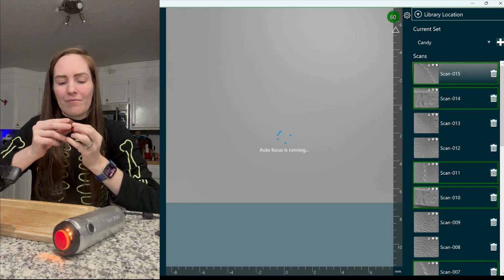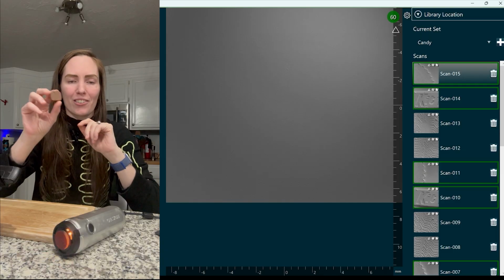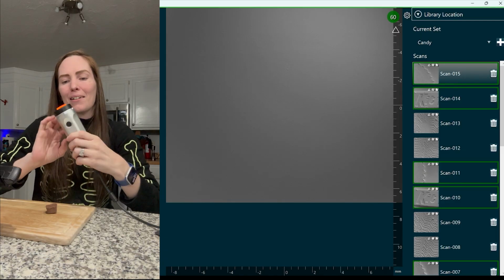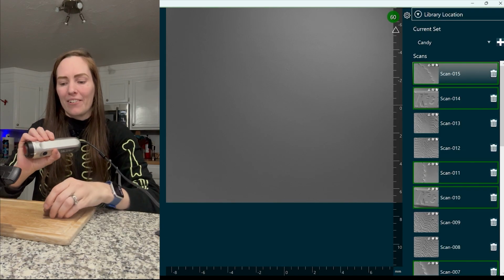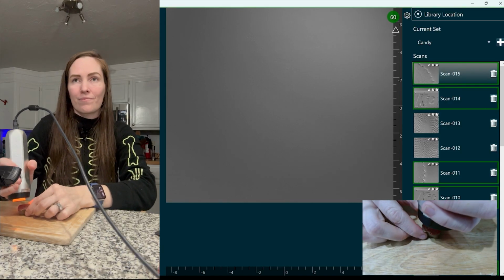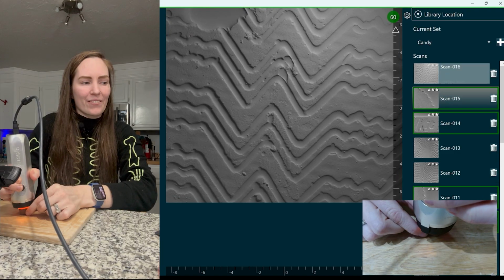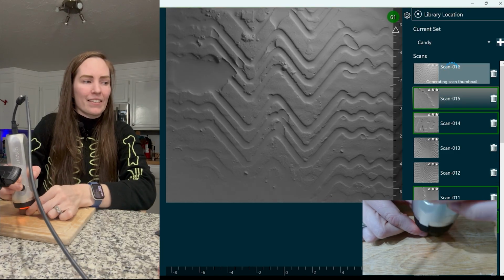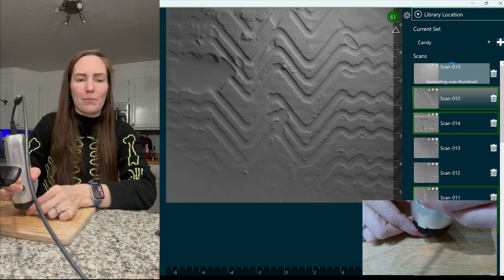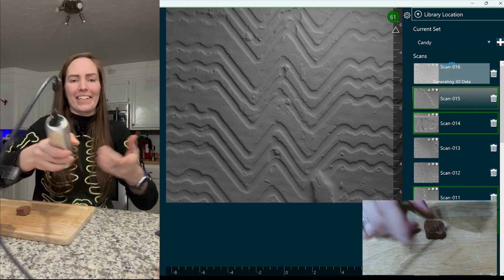So these must be resting on a textured plate or something like that to dry the chocolate with this pattern on it. And I'll press our system down onto that, press the gel into that, like this. And we can see all of that texture. We can also see some porosity there where I'm missing a little bit of chocolate. It's kind of a fun one. And click the button again to take another one.